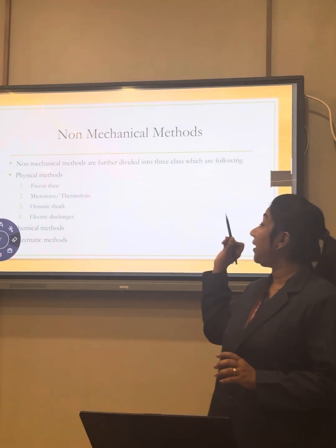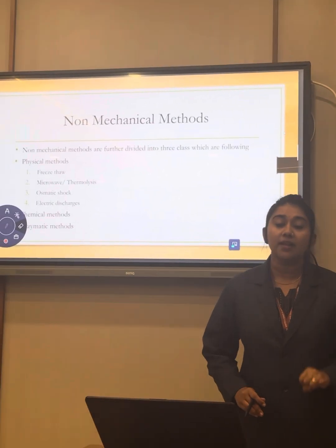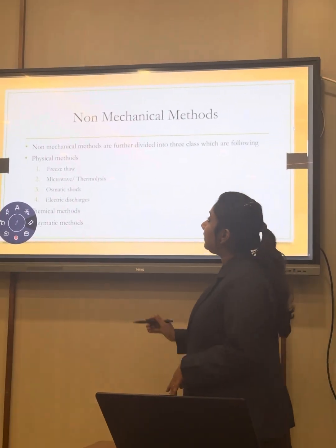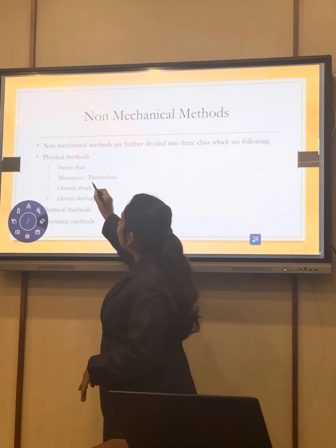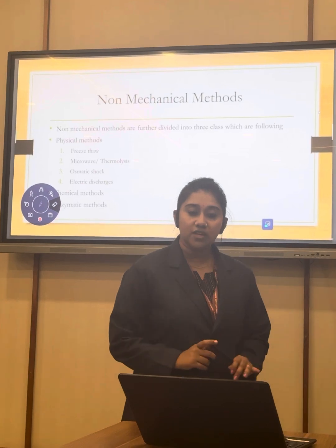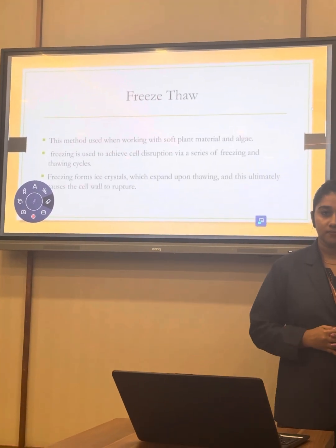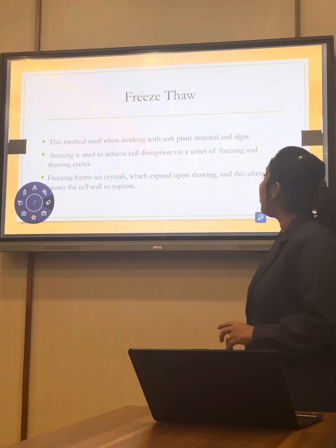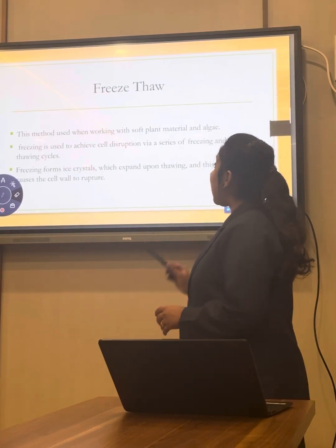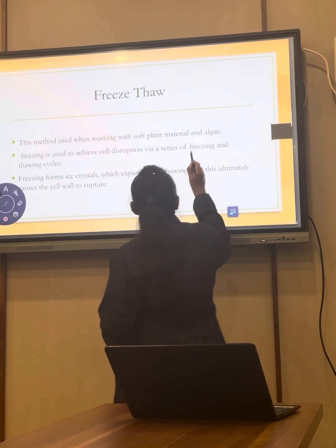The non-mechanical method is classified into three: physical method, chemical method and enzymatic method. The physical method contains freeze-thaw, microwave, osmotic shock and electric discharge. First we discuss freeze-thaw. What is freeze-thaw? It is commonly used for soft plants and algae. It is achieved by freezing.